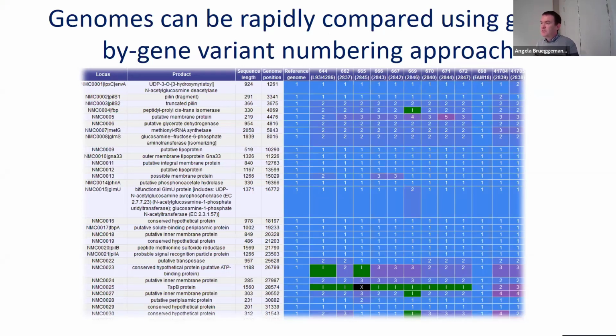To know what differences we could find within the genomes from the strain that had been plated out within the laboratory and the one that had been recovered from the worker. At that time, we didn't have any way of doing that. And so over a very hectic weekend, the very first version of Genome Comparator was written. We were literally only looking at 2 genomes and comparing them against a reference.